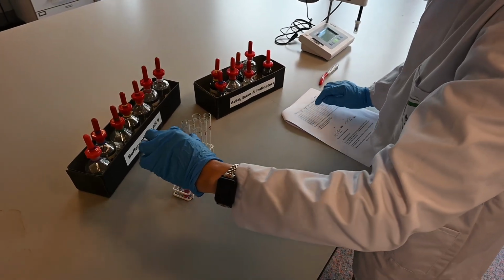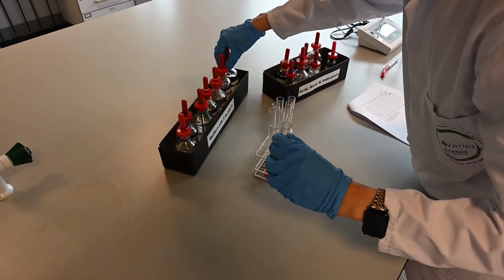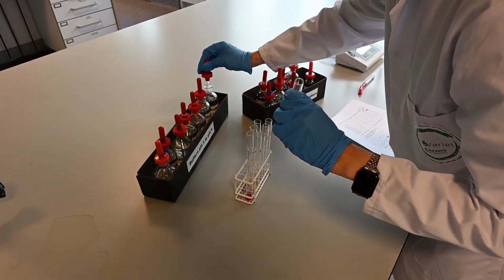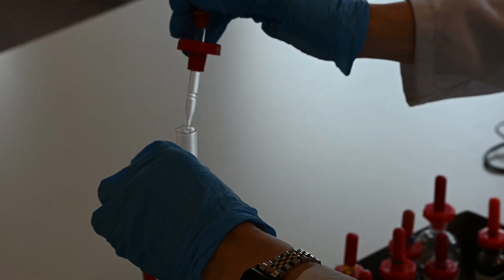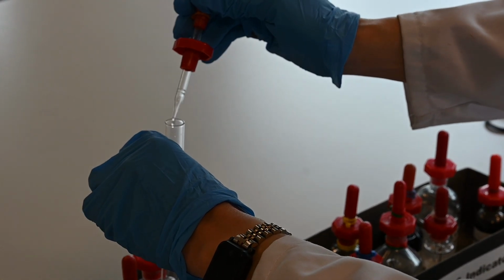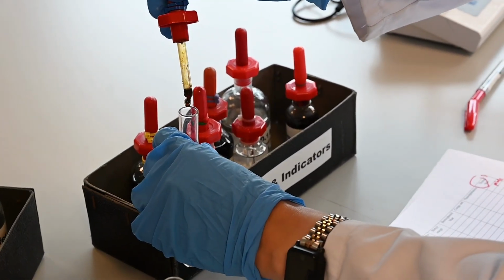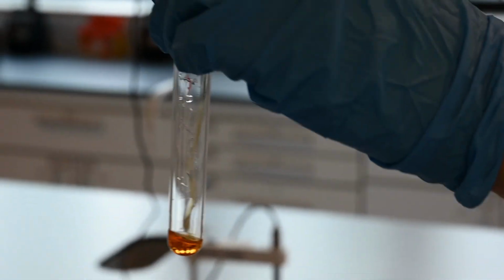Next, we've got buffer pH 3. Let me see. Buffer pH 3. So squeeze the rubber teat and put it in. Just a bit more. No touching. Put in the thymol blue, and then 1, 2. Two drops. What's this color? That would be orange. Yes, it's orange.